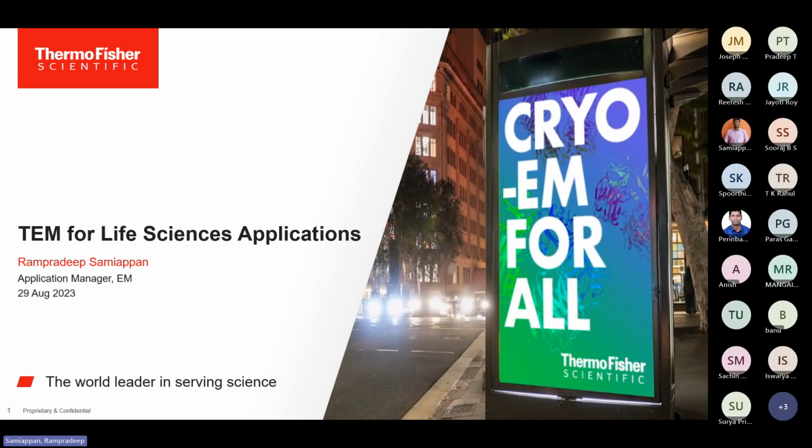Before that, I'll quickly share my background. I worked in a company called Veranova AB in Stockholm, Sweden, as a senior scientist. I have expertise in the field of structural biology, especially in cryo-electron microscopy and negative staining. And I work with different particle types: virus, lipid nanoparticles, liposomes, and different drug delivery particle types.